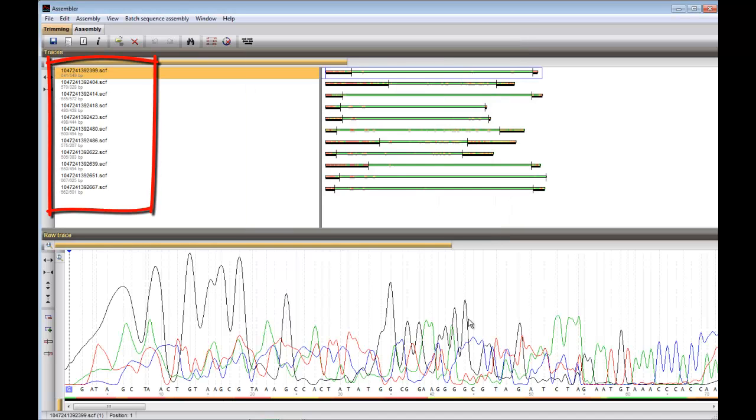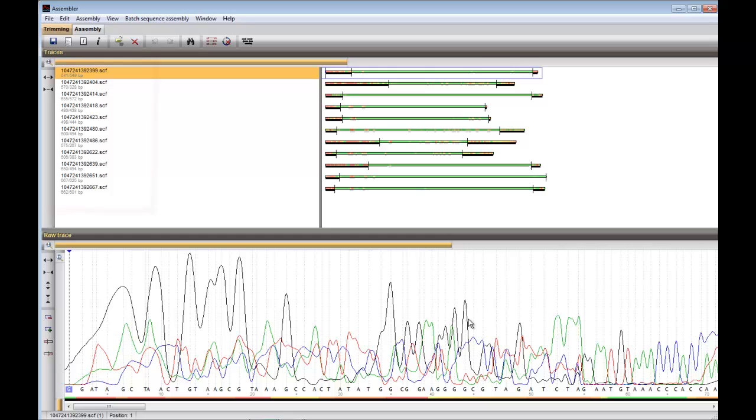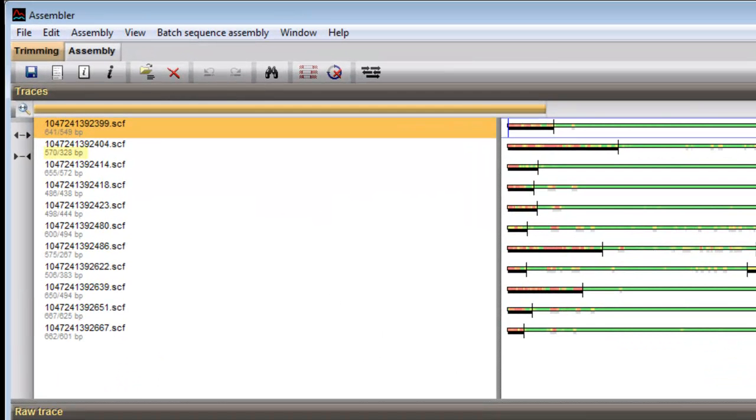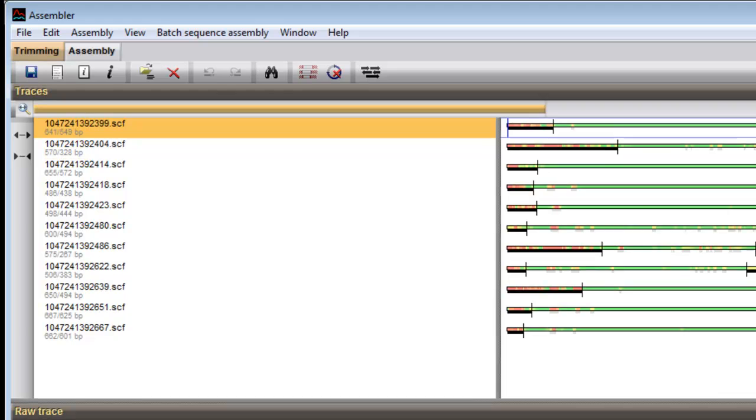The left upper panel lists the names of the chromatogram files, each with their length in base pairs before and after trimming.